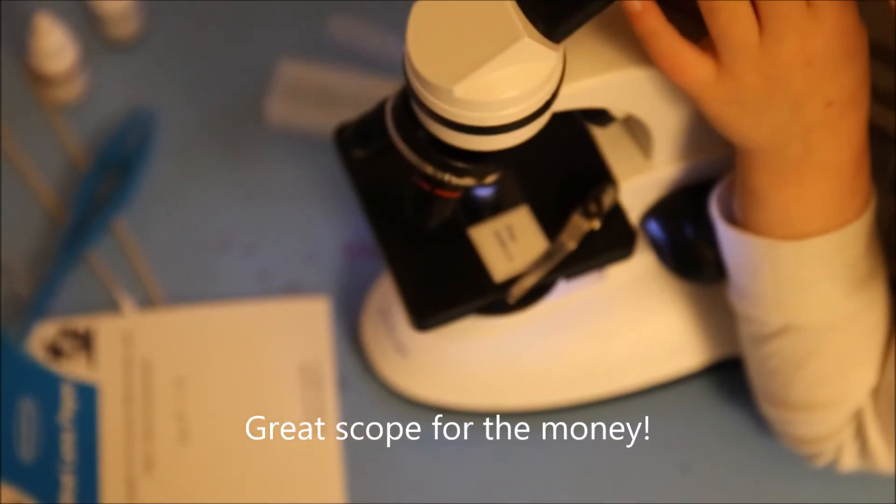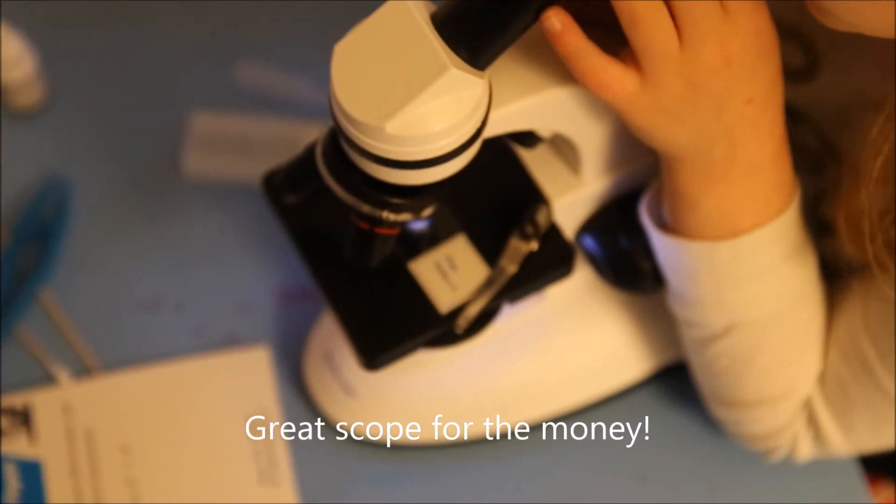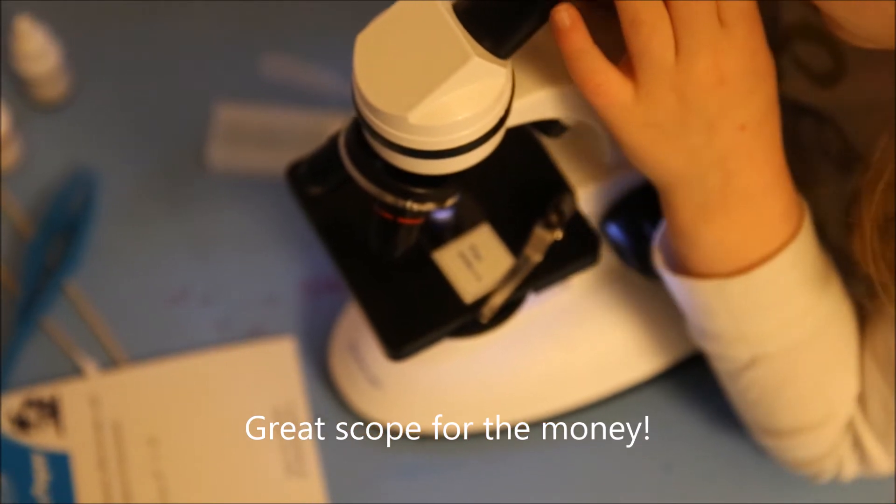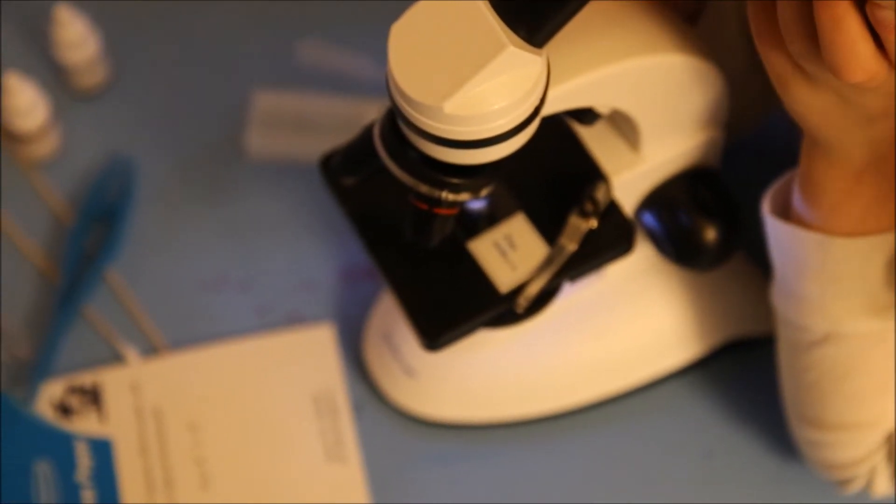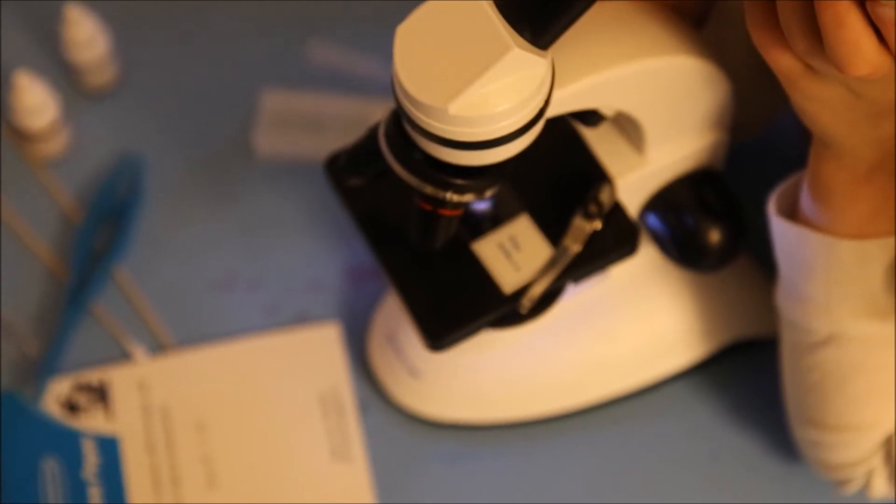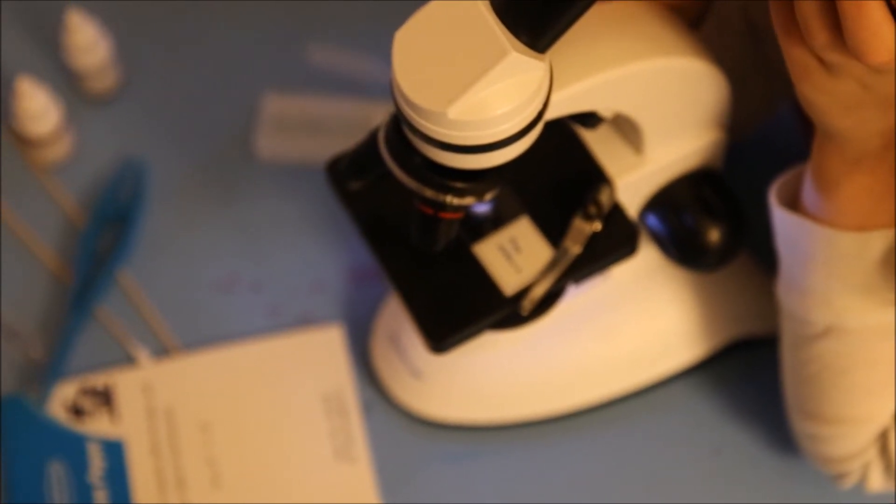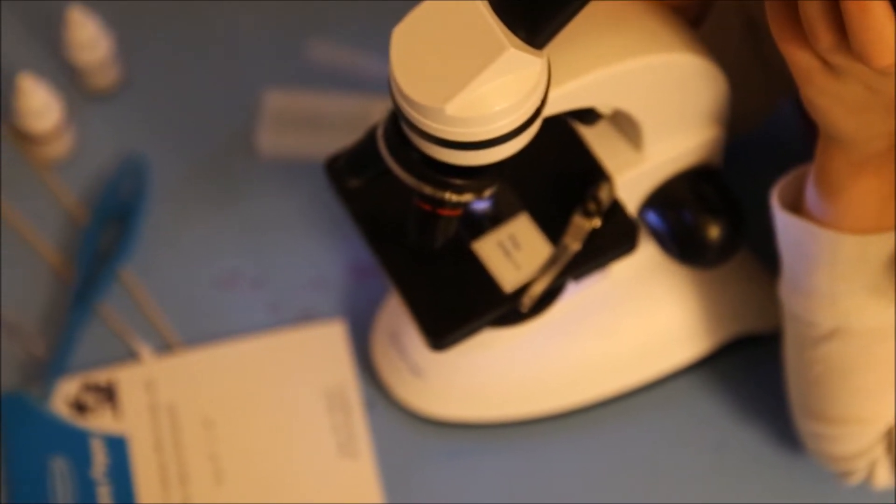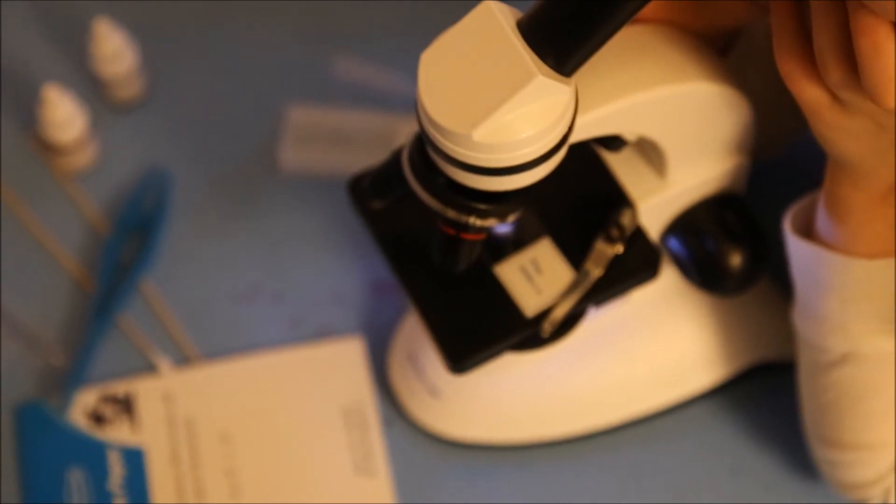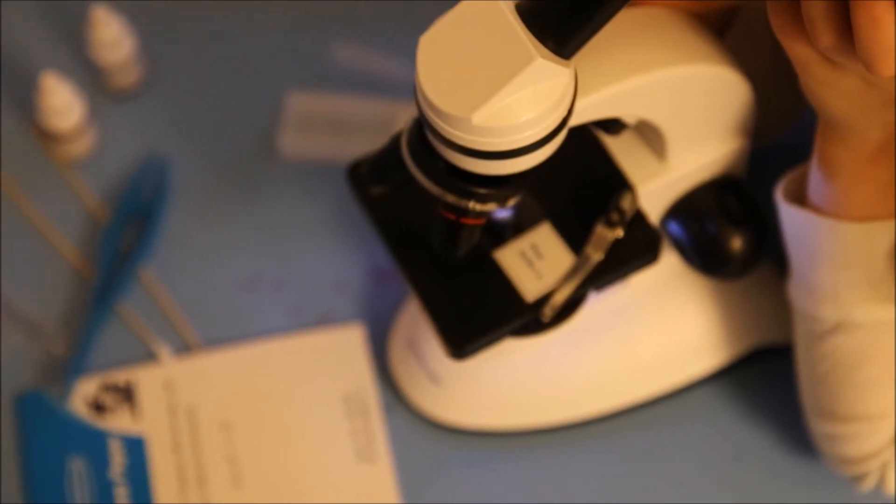There is a circle. There is different types of red and little circles. There is a circle of green, and orange, and white, and some more green, and some more red.